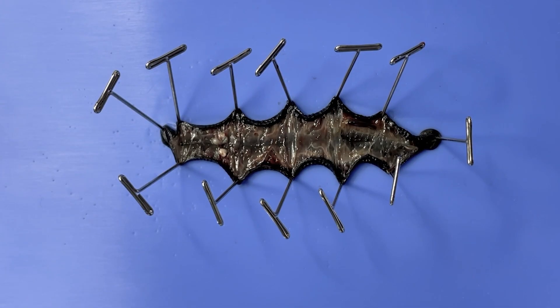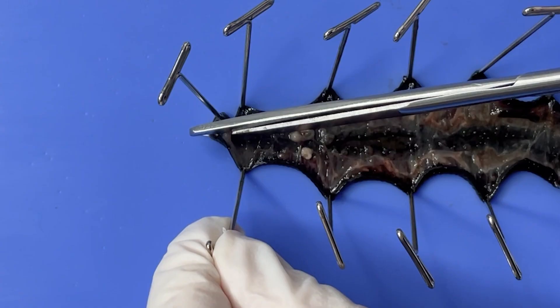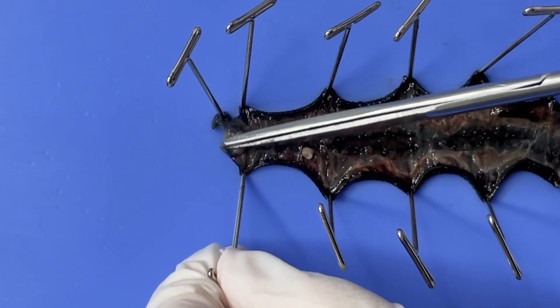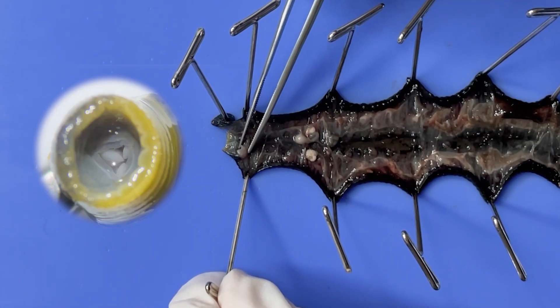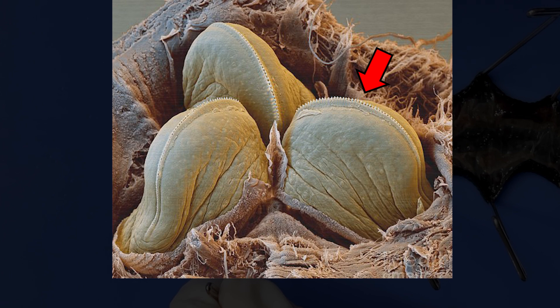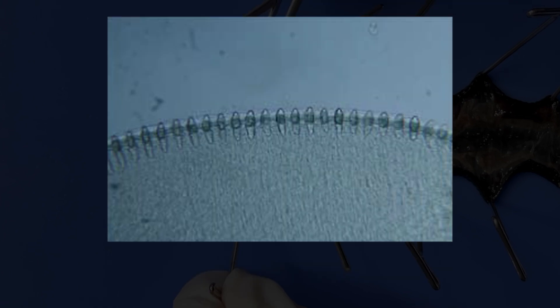When you cut the head part a bit more and open it up, you can see their jaws. The jaws have around 100 small teeth, and between these teeth, there are openings connected to salivary glands, which secrete saliva.